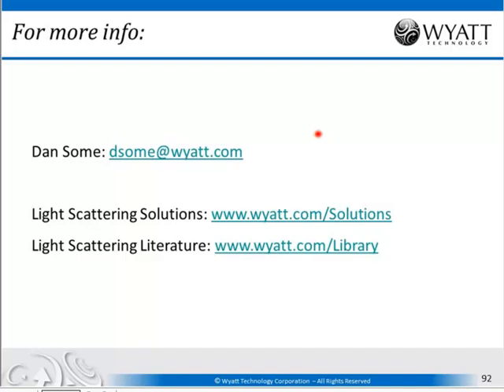Okay, perfect. Next question. How much modifier do you need to be able to measure the protein fraction and modifier fraction with protein conjugate analysis? So it's about 3 to 5% additional molecular weight. So if your glycans represent at least 3 to 5% of the total molecular weight of the complex, that's where the analysis becomes robust. If it's down in the range of 1 or 2%, it's not going to be as accurate.